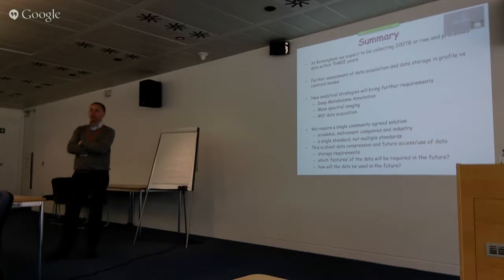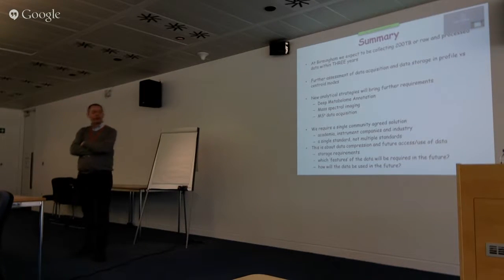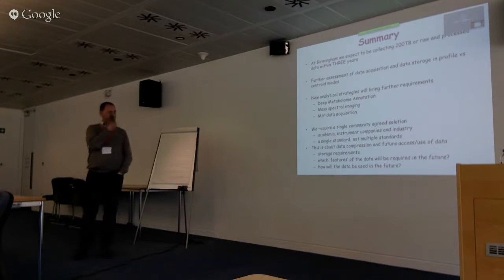Right, and are there updates to the chemistry within the same machine? Does somebody come along and do something that makes it more productive? You can get upgrades on instruments, but I think it's more important within the Phenome Centre that we're collecting equivalent data on day 1 or day 700. That's the important thing, making sure it's reproducible over that time frame. We won't be trying to measure everything or more. We're just trying to make sure it's reproducible. I mean, comparable data. Yes.